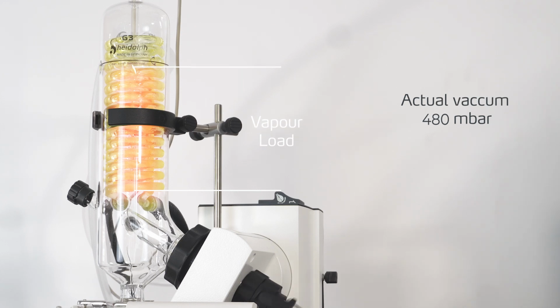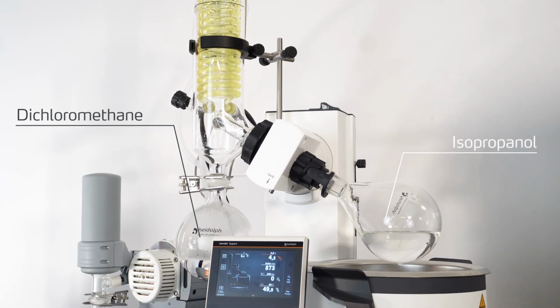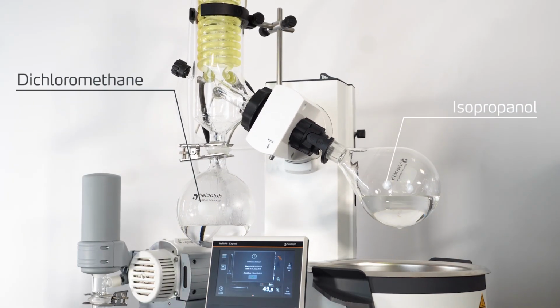The DAA program will adjust the vacuum automatically several times to maintain an efficient and fast evaporation and a good separation from solvent to solvent, or solvent from a solid or powder. At the end, the system detects no vapor load anymore while recovering the temperature level on the sensor, and will finish the process automatically.